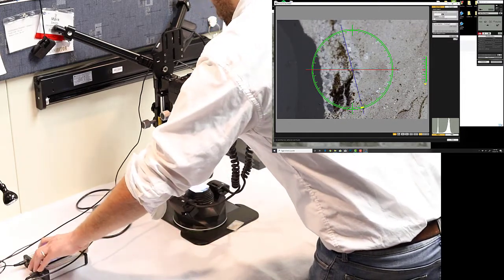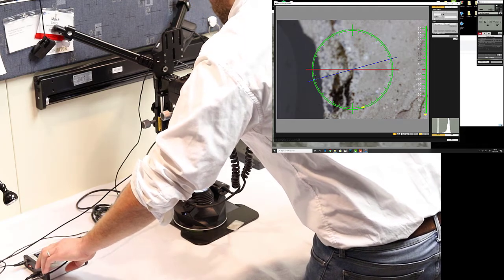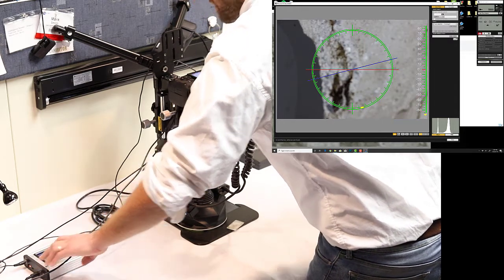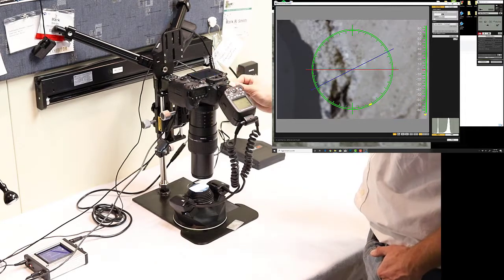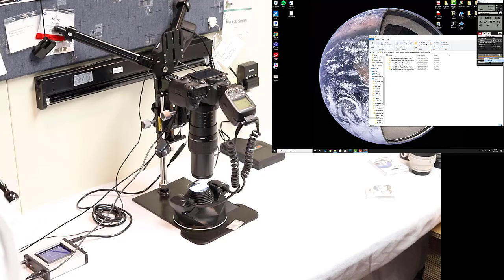We're going to change our focal plane, so we're going to change our starting parameter here since we swapped out the sample. That's our start. This is our end. We didn't change the polarizer, so the settings are correct. We'll come back to our computer. We'll open up a quick preview again.